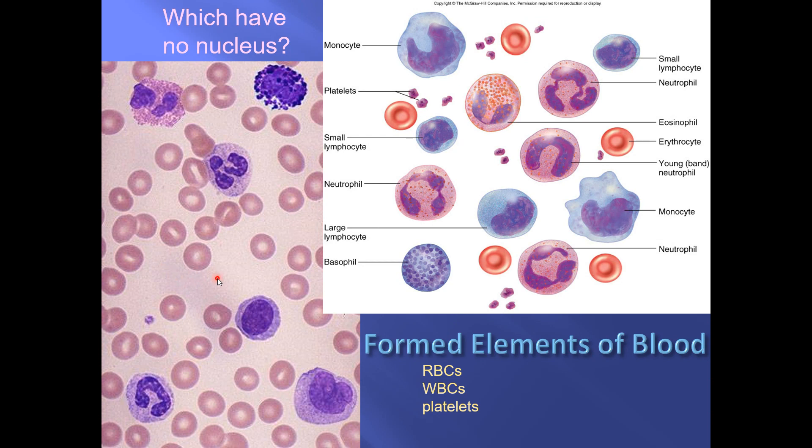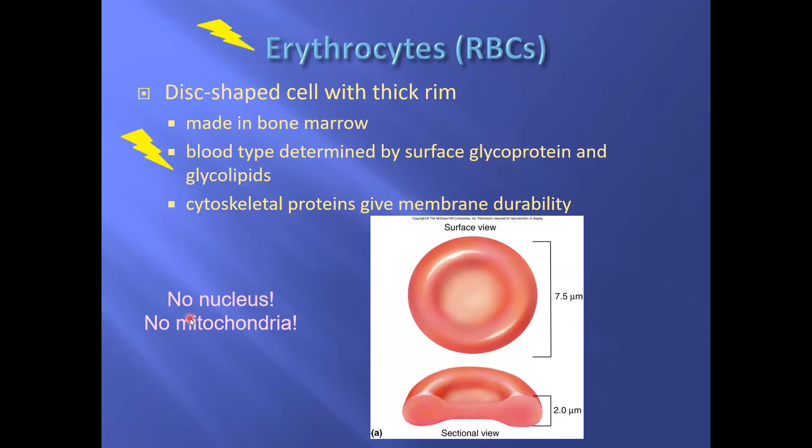Red blood cells are that color whether the slide has been stained or not, because they are filled with red pigment. Importantly, red blood cells do not have a nucleus. That light area you see inside a red blood cell is just the thin area in the center. Another word for red blood cell is erythrocyte, and the cool kids call them RBCs. Of the formed elements, red blood cells and platelets have no nucleus; white blood cells do.